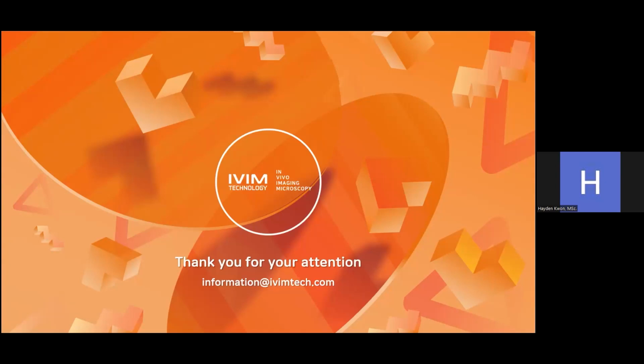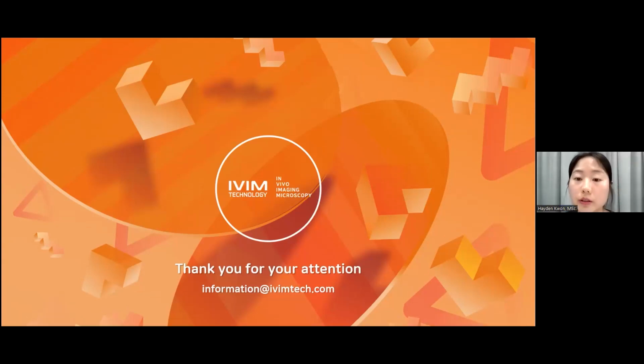Thank you for the questions. The imaging depth varies depending on the tissue or disease model of interest. But typically, confocal microscopy can image up to 100 to 300 micrometers, whereas two-photon microscopy can reach around 500 micrometers.